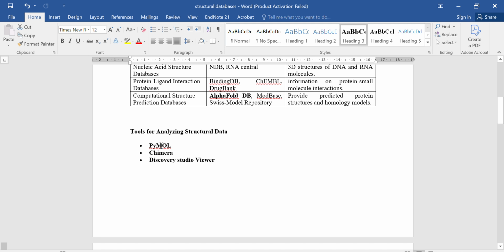Those viewers, my choice is PyMOL, Chimera, and Discovery Studio Visualizer. You can download any one of them and use it, right? At present, I have Chimera. PyMOL is also very easy. That is the Python molecular viewer. There are lots and lots of tutorials for all three available on YouTube. You can go there and learn how to play with protein molecules and ligands or docking results. So at present I have Chimera.